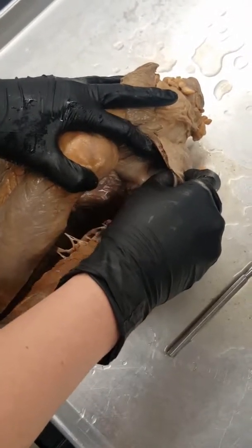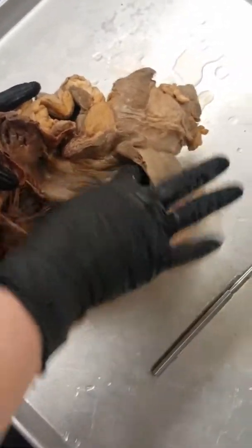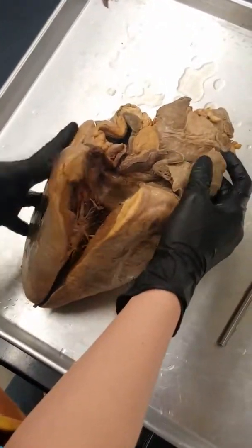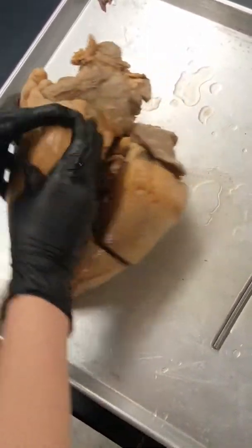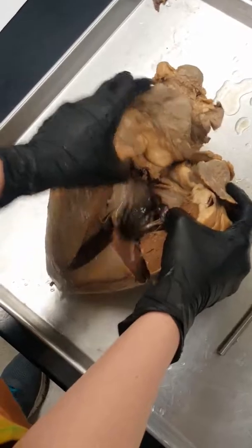Remember how I said the auricle is kind of your pouch — you can see inside the pouch now. We still have our chordae tendineae, and here you can see the papillary muscle a little bit better — it's kind of where all of the chordae tendineae are attaching, right in there.